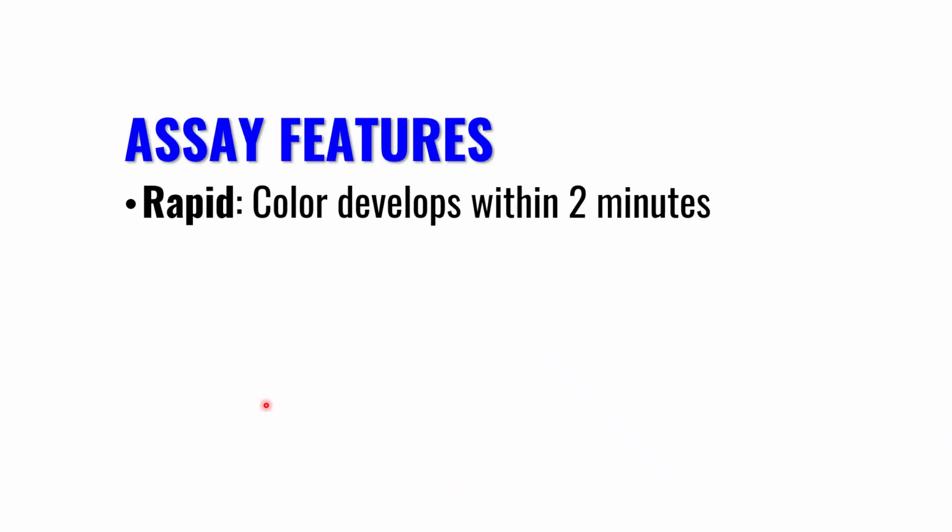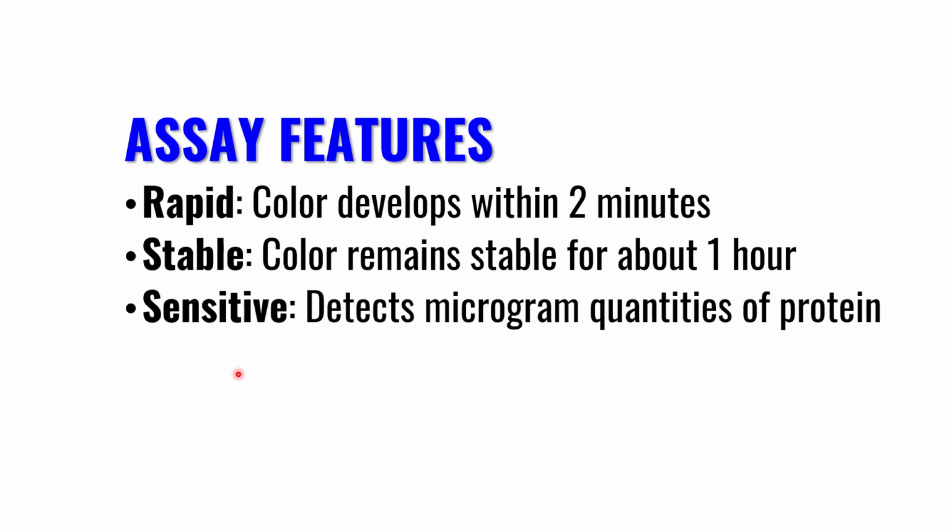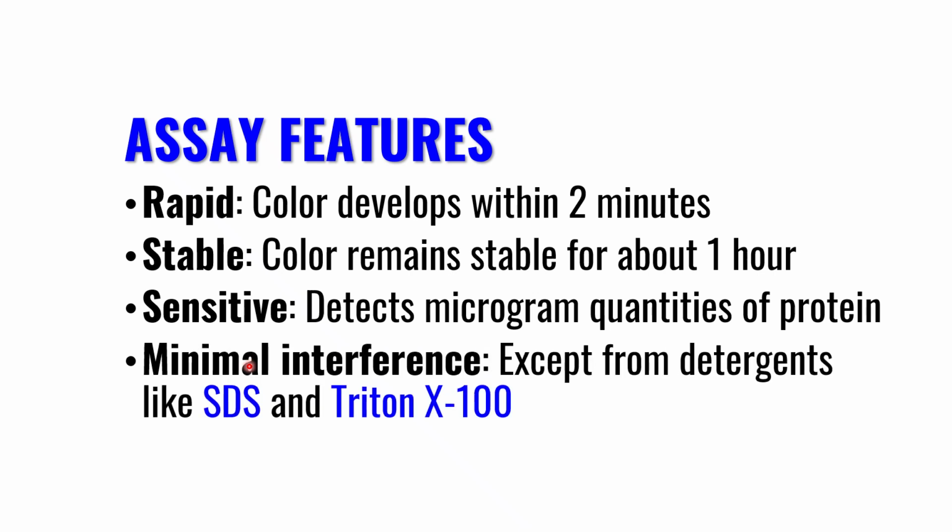So the method is rapid as the color develops within 2 minutes, and it is stable also as it can last up to 1 hour. So it provides flexibility in operation. It is a highly sensitive technique which detects protein in microgram quantity and allows us to do the assay in a microtiter plate as well. Except for some detergents such as SDS and Triton X-100, there is minimal interference in this method.